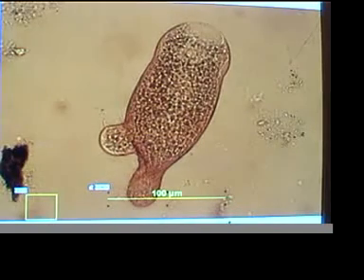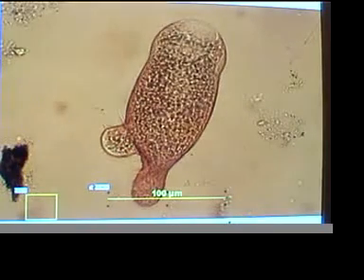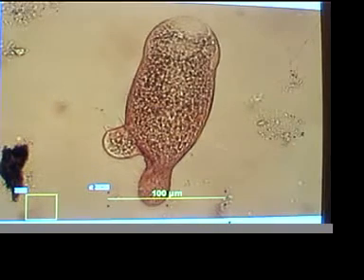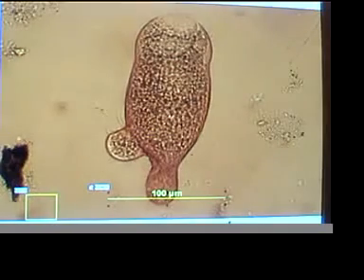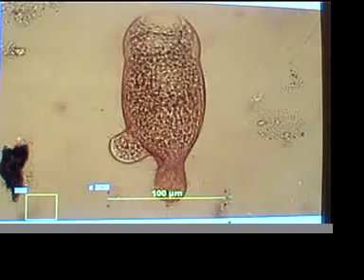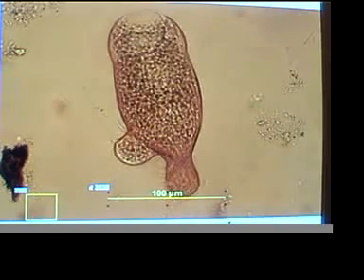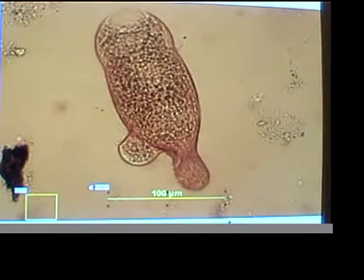depending on where you're looking at, a little bit back farther from the microscope stage, and angled the angled electrode slightly down. So we're going to have to experiment with the geometry of the placement of the plasma bulb. It seems to be very important.